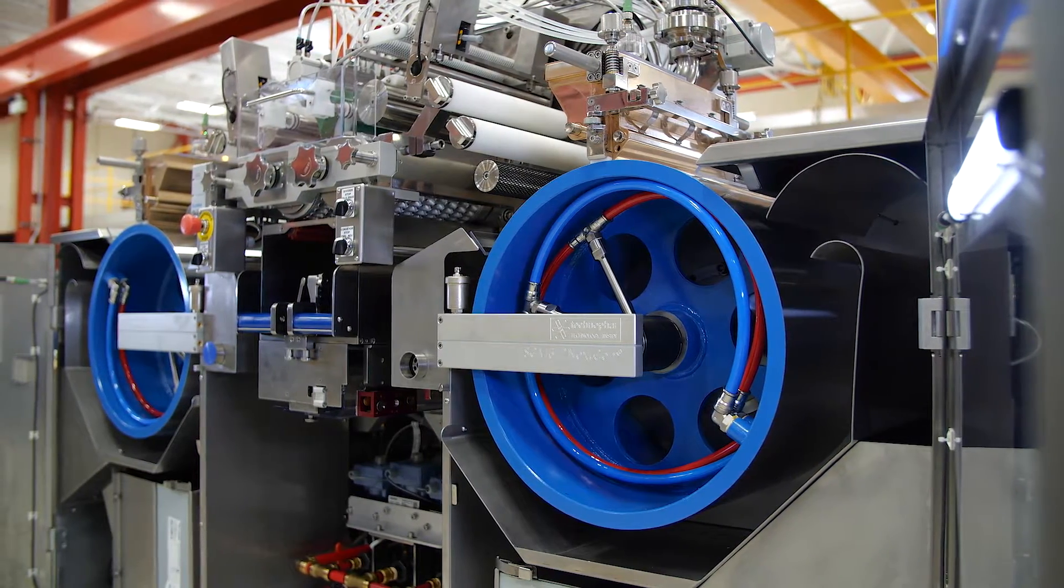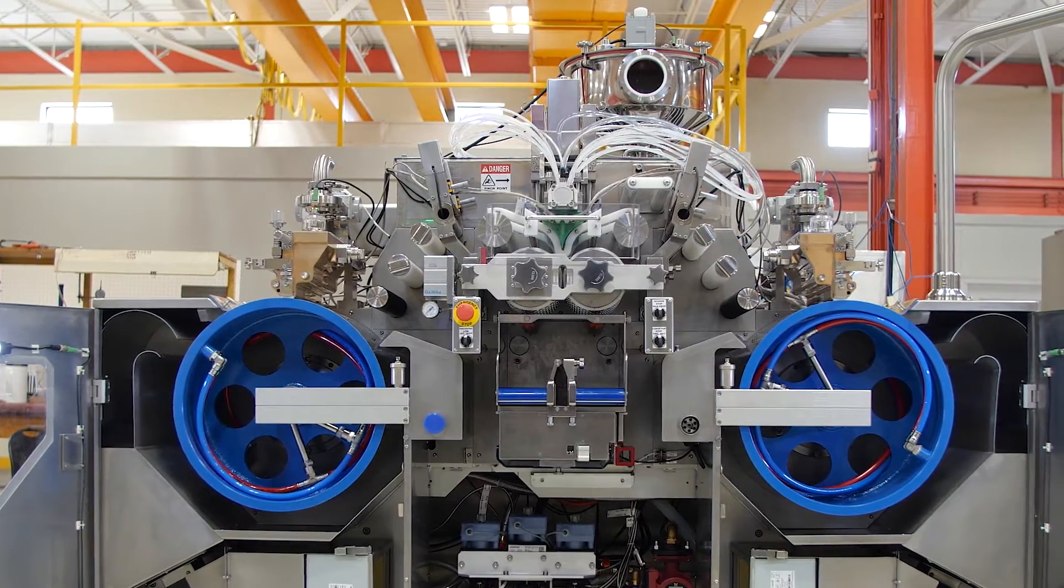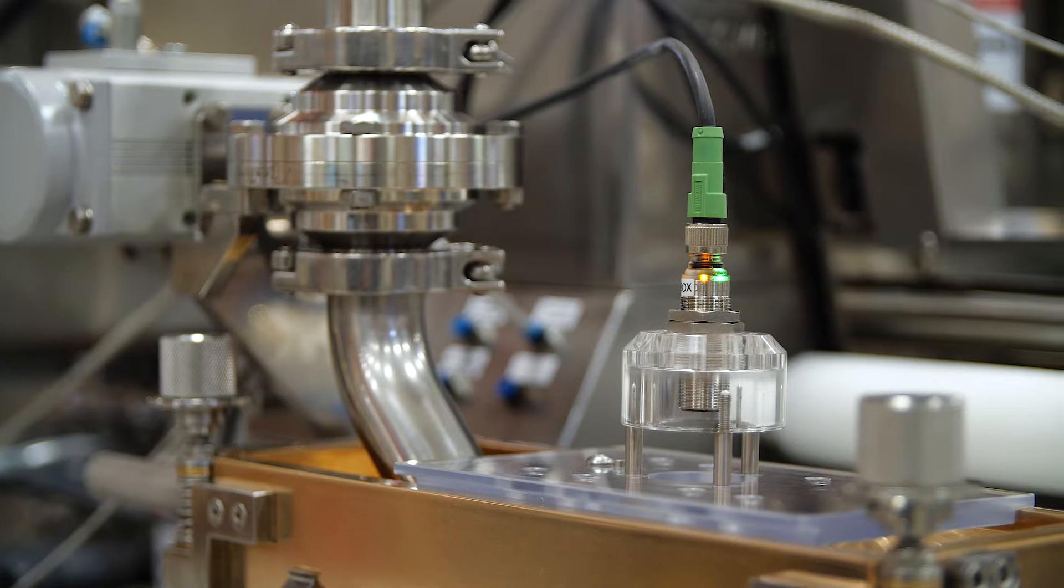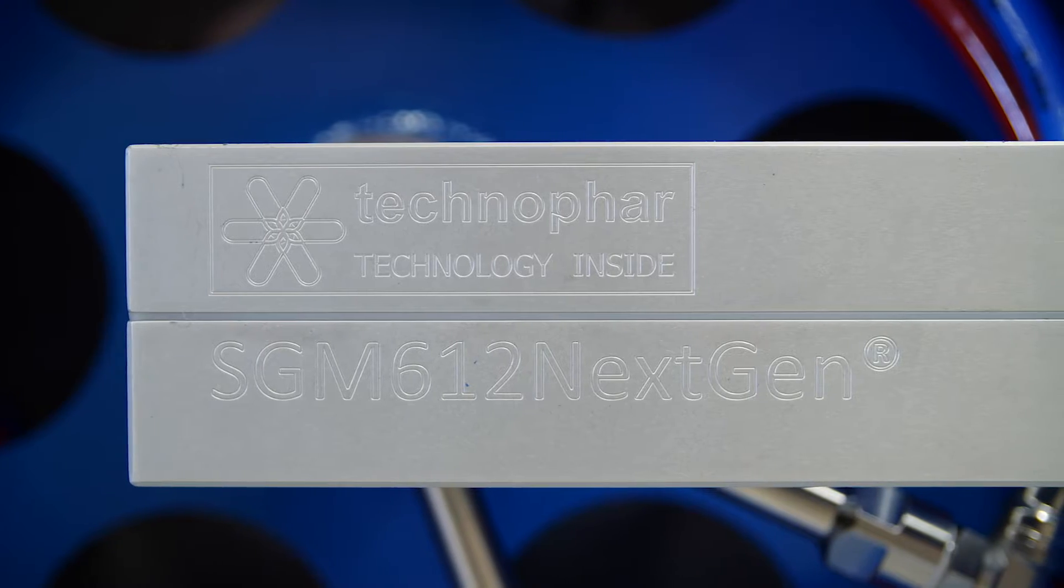The SGM 612 NextGen is a machine designed by our team of engineers with input from our global customers to solve our customers' future challenges today.